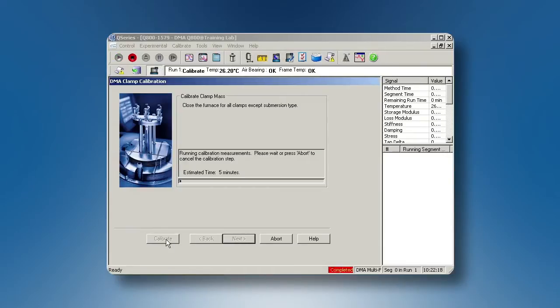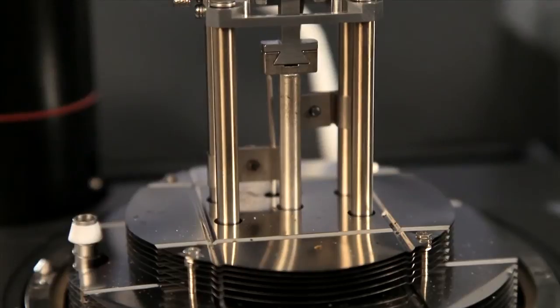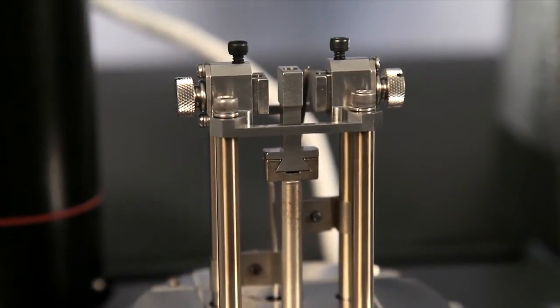This calibration step is to calibrate the mass of the movable clamp. Shear Sandwich Clamp is typically used to measure soft materials such as foams, rubbers, or polymers above their glass transition.